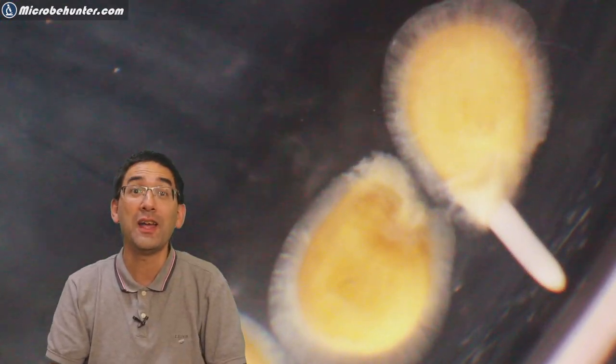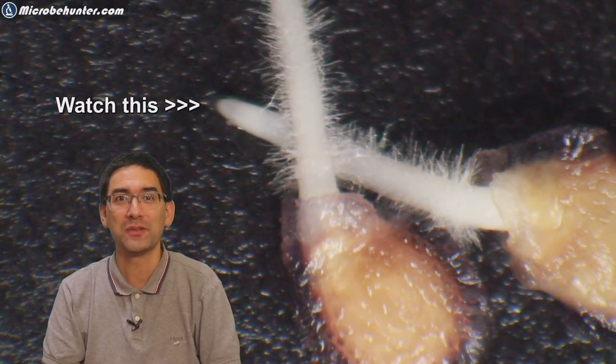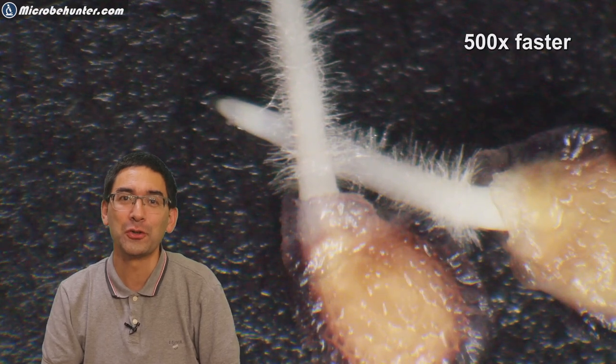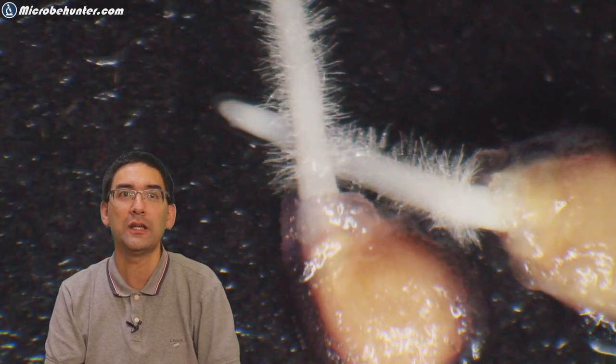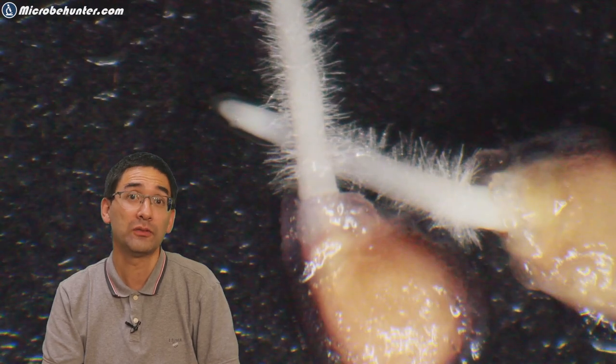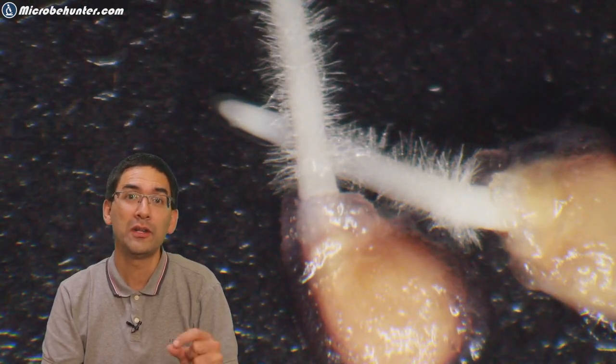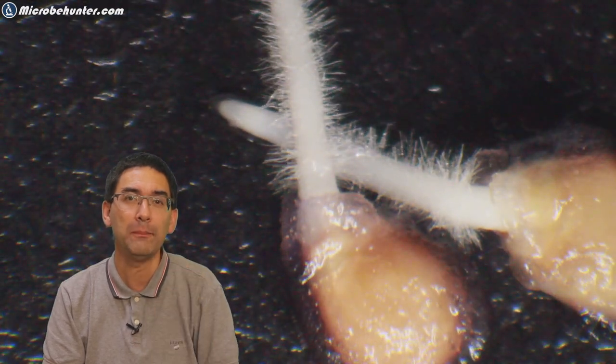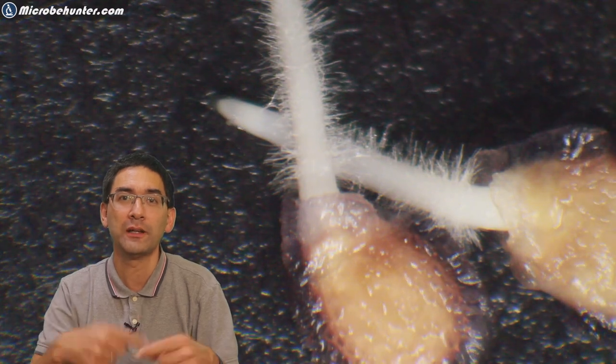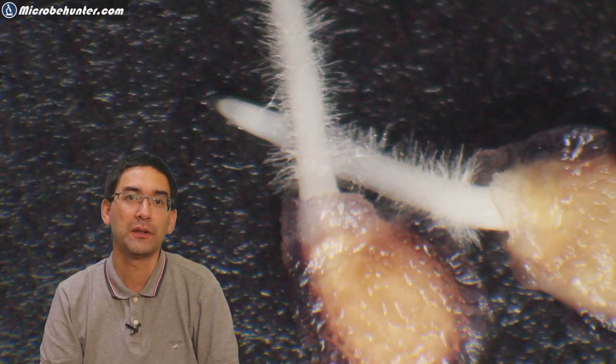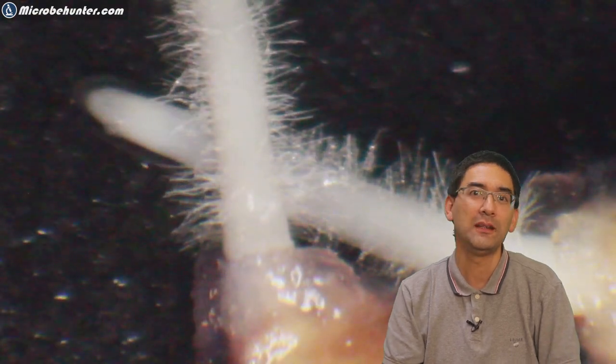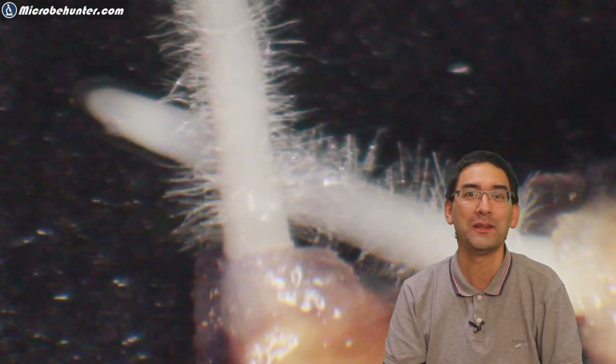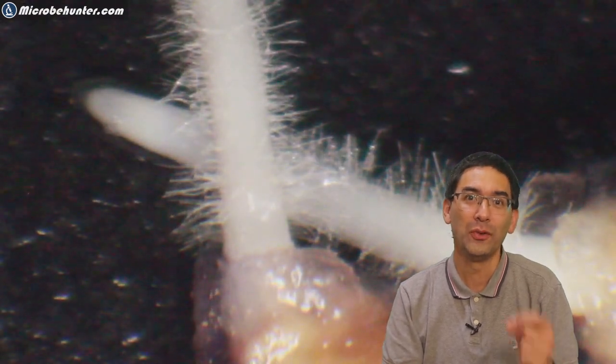These seeds here are still underwater. It was a second batch of seeds that I was testing, and even there the roots started to grow quite well. After a few days I could again see the root hairs. I'm going to now show you in time lapse quite rapidly how the root tips actually started to grow. Look at the root tip very carefully. This is 25 minutes. I've now repeated the whole thing in a cycle so that it's better to observe the actual root growth. Time lapse of root growth is nothing new, but the thing that is new here is that it's under the microscope and the time was relatively short.